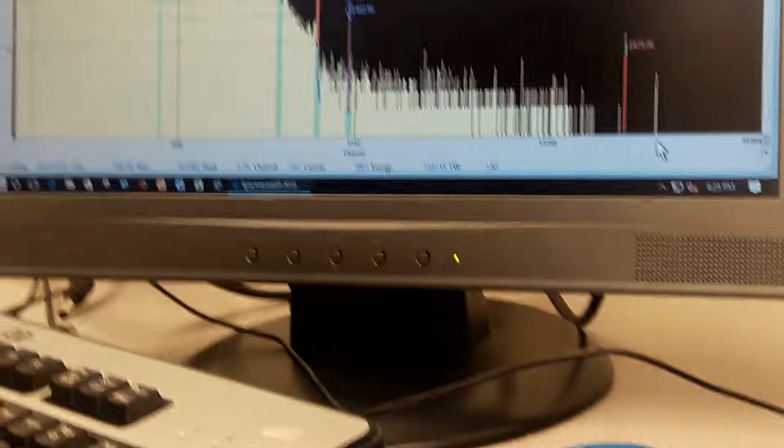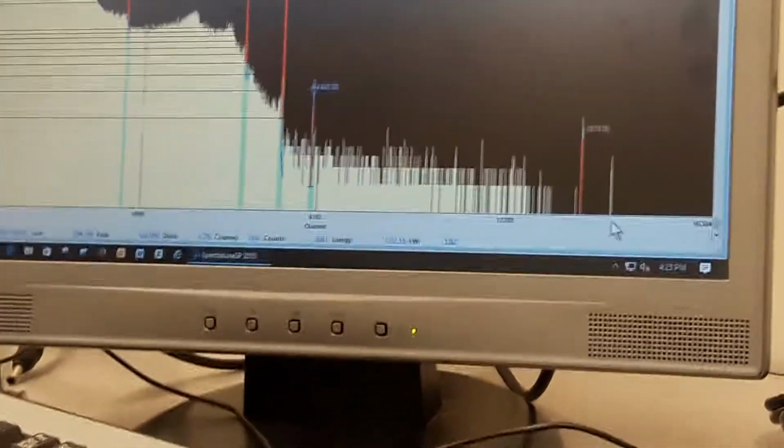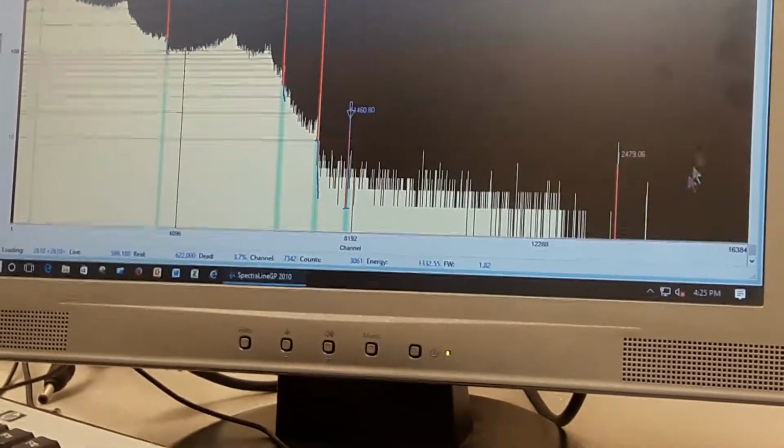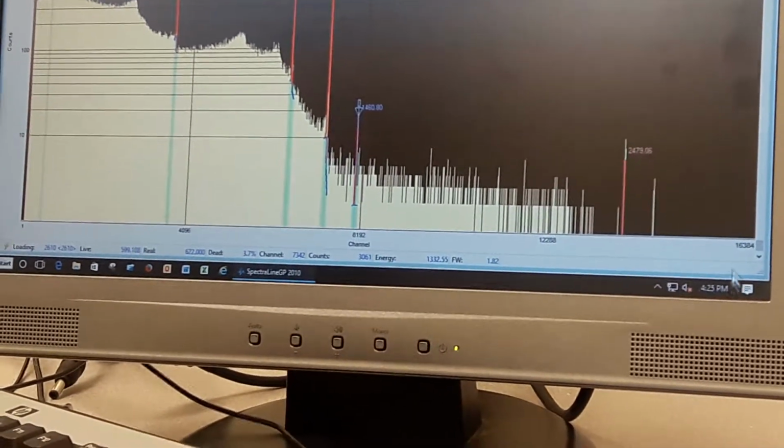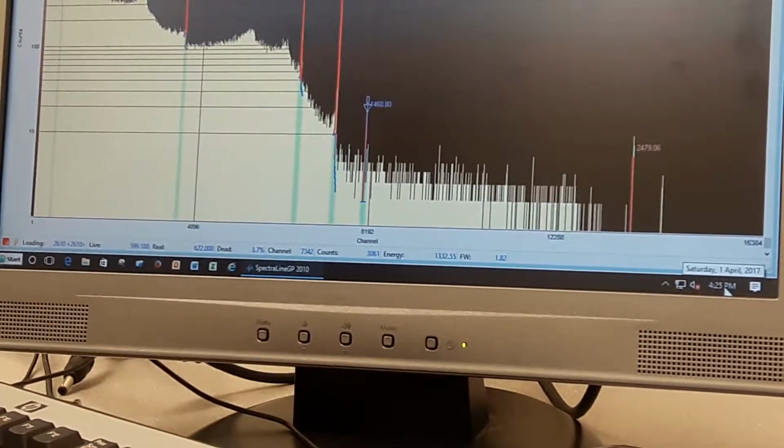I'm assuming that the computers used for this application will be dedicated computers for this particular application. So hopefully you will not have to use this for other applications where they will expect a different date. So look at the date.